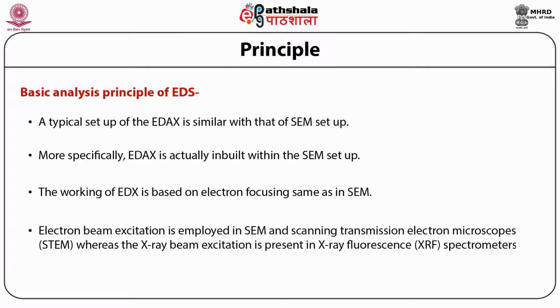Electron beam excitation is employed in SEM and scanning transmission electron microscopes, whereas X-ray beam excitation is present in X-ray fluorescence, that is XRF spectrometers.